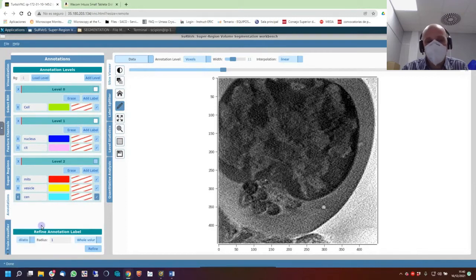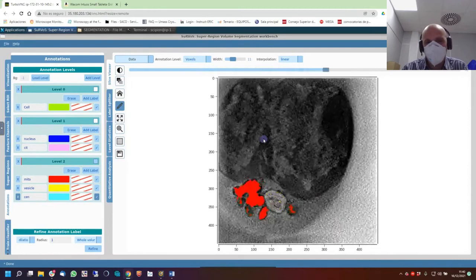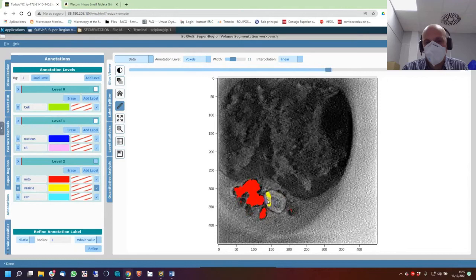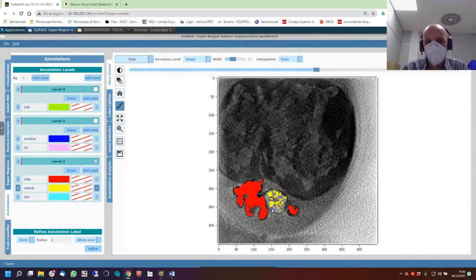Sometimes it happens that you start segmentation, and where you are in, you realize that you need more time, or you need to change the structure. And it's true that for this, it's not easy to change things. You cannot select a label and send it to another part. There's something that will be nice for this software, but it's not easy. So it's still in development.